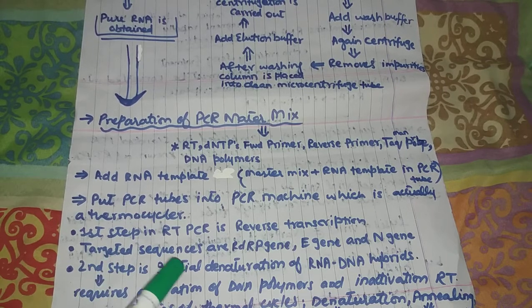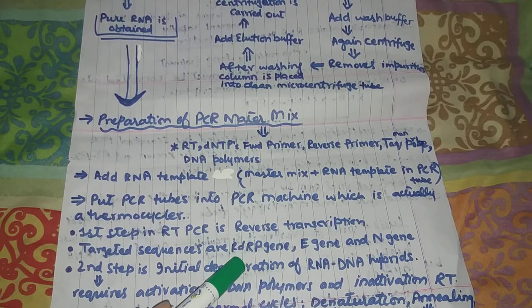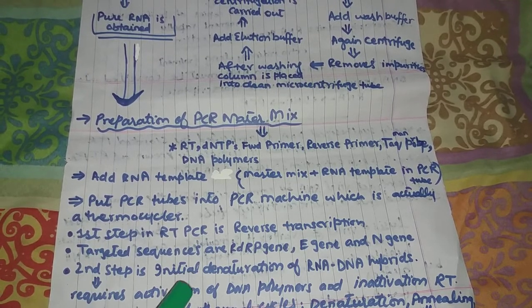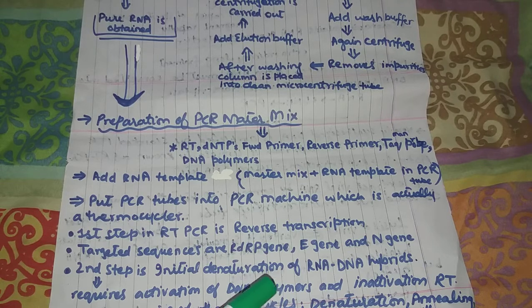The targeted sequences are the RdRp gene, E gene, and N gene. The second step after reverse transcription is initial denaturation of the RNA-DNA hybrid, which is formed as a result of reverse transcription.